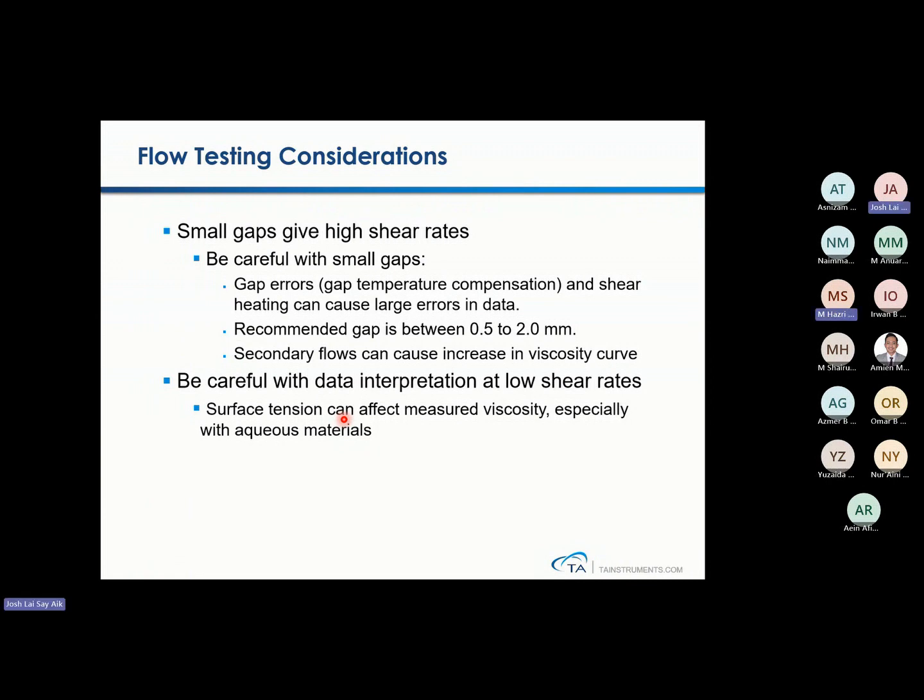Let's say we have the epoxy and hardener. Our customer requests to determine the changes of the phase. For example, they set a variable temperature, not a constant temperature, and they want to see the phase change from liquid to the sample becoming a solid.